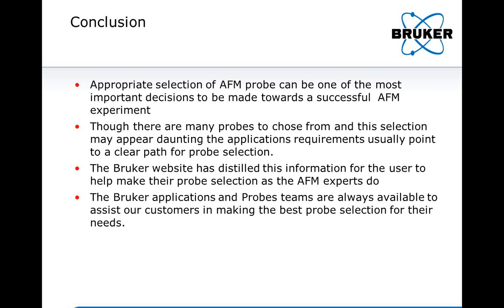That's a good point about the last one. The level to which you can get quantitative results out of QNM really has to do with the level that you calibrate. That said, we do have a lot of people who work just in the qualitative mode to get contrast.